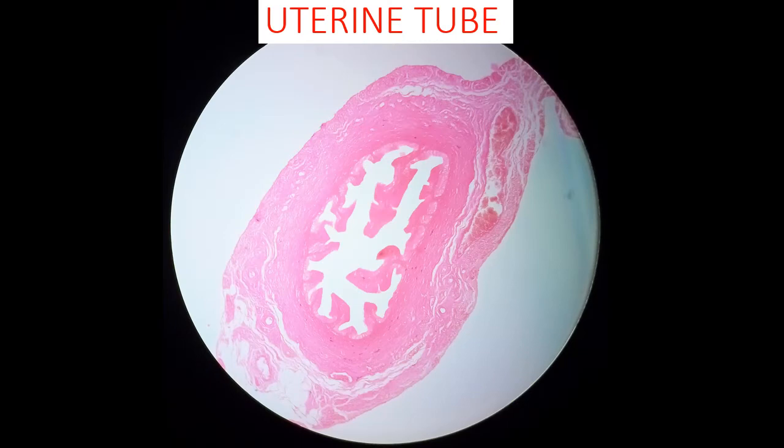Then moving to the uterine tube. How to identify the uterine tube? It is lined by simple columnar epithelia with cilia, and the mucosa is thrown into folds. Here you can see the mucosa thrown into folds, and it has an outer layer called the muscular layer. So that is how we have to identify the uterine tube.